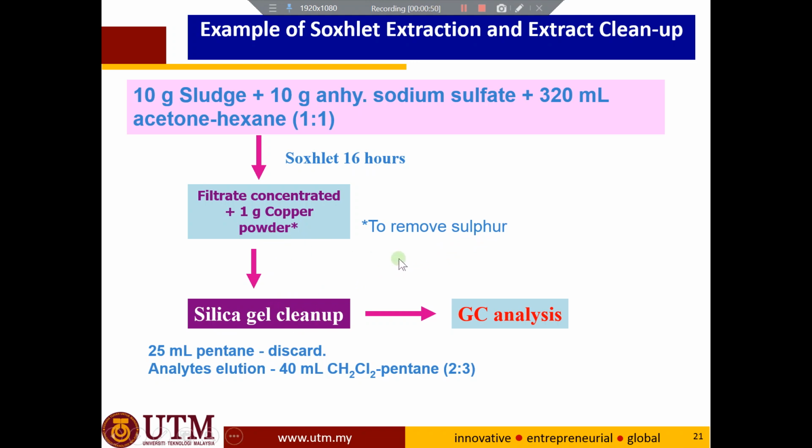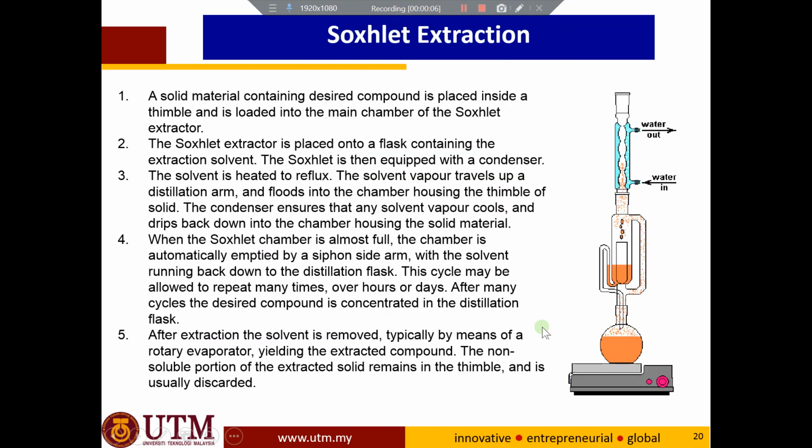And then the extract is ready for GC analysis, or if you want to collect a solid sample, solid analyte, you can proceed to the rotary evaporator. Do you need to remember any of this? I don't think so, but the basic solid extraction here, you need to understand and remember. The most important key is to understand. If you can understand, you don't need to remember.